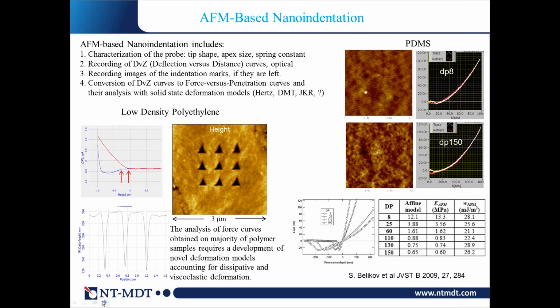However, you can do it in different modes. You can do it in contact mode, in amplitude modulation mode, or in peak force mode. In most cases, you are deforming the material, and what people want to extract is the force versus distance curve, then analyze that and get an idea about the quantitative elastic modulus or adhesion. That means in order to do that, you need to record a force curve. That's the conventional wisdom, and then analyze this force curve. That sounds simple, and that's absolutely not true.